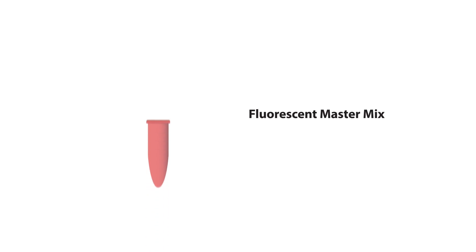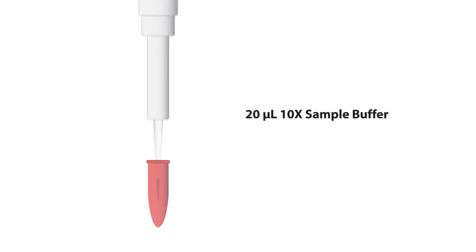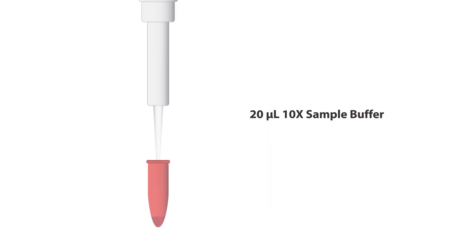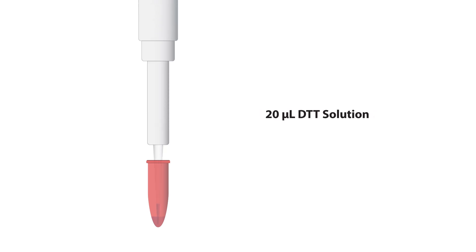To the pink fluorescent master mix tube, add 20 microliters of 10x sample buffer and 20 microliters of the prepared DTT solution. Mix by pipetting up and down.